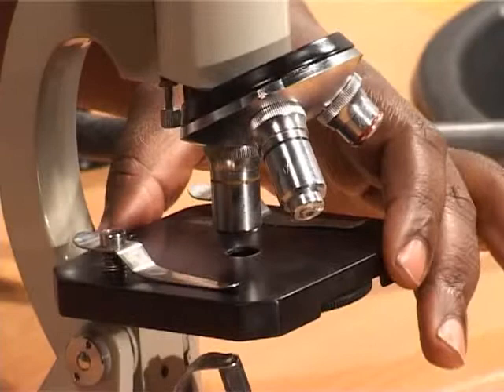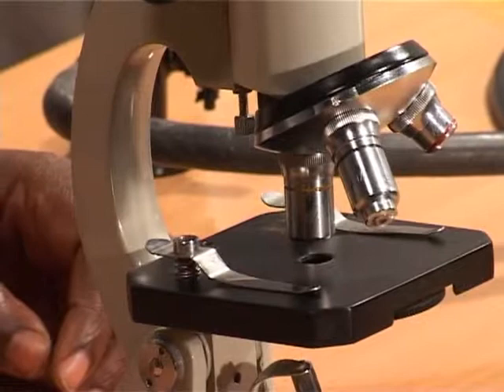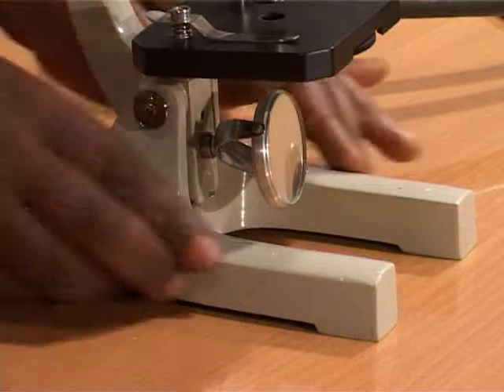Okay? Then I have these two parts, we call them clips. Let us move on. We have a mirror here. This is what we call a mirror. Okay, the last part that we'll look at is this part here, where the microscope stands. We call it a base.